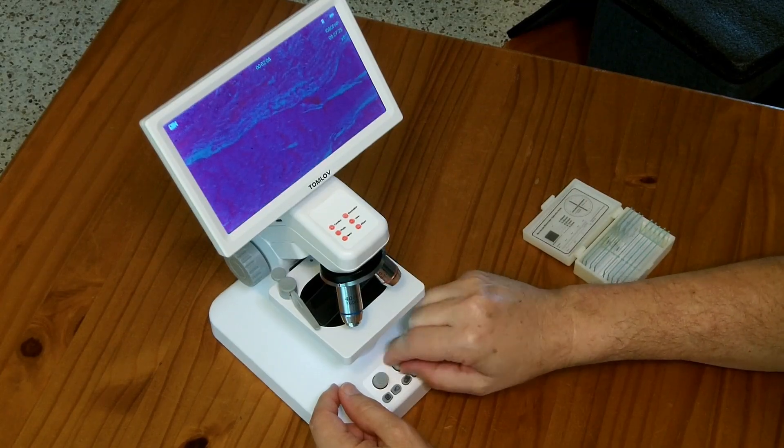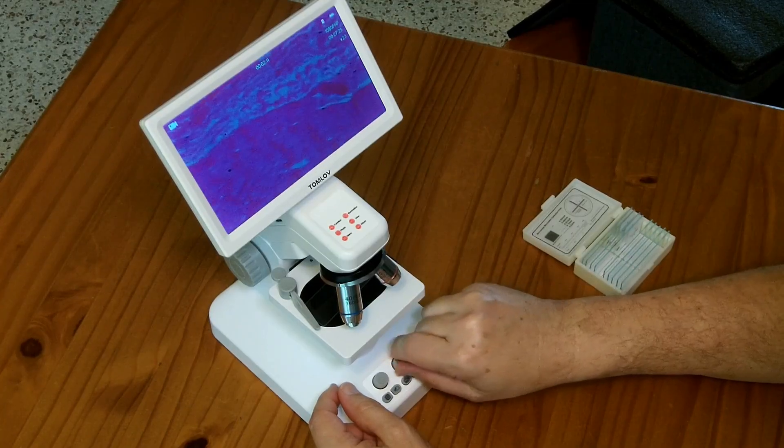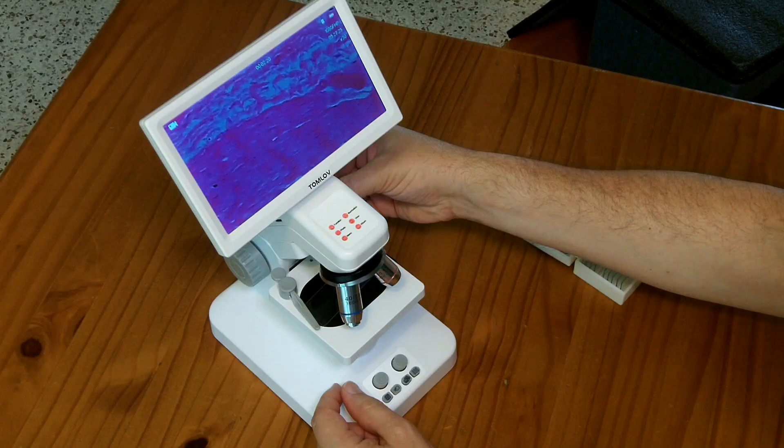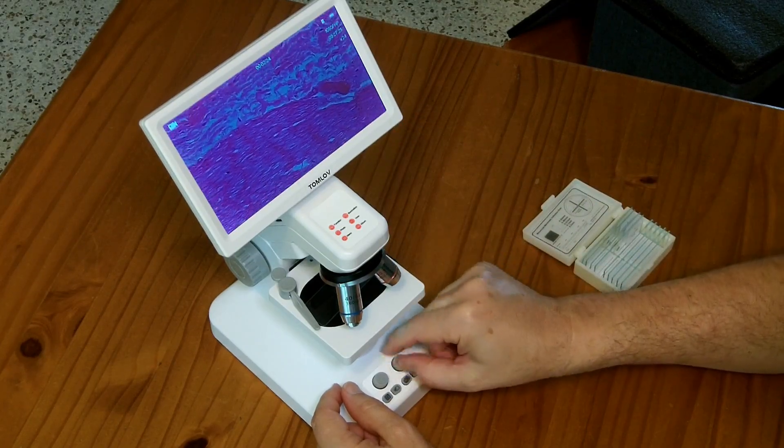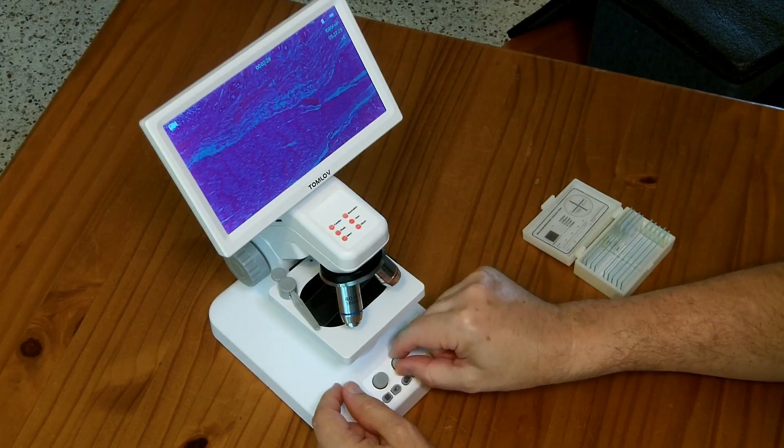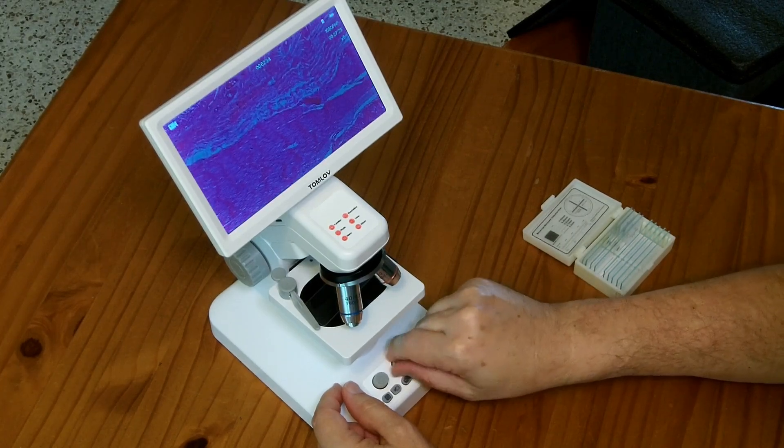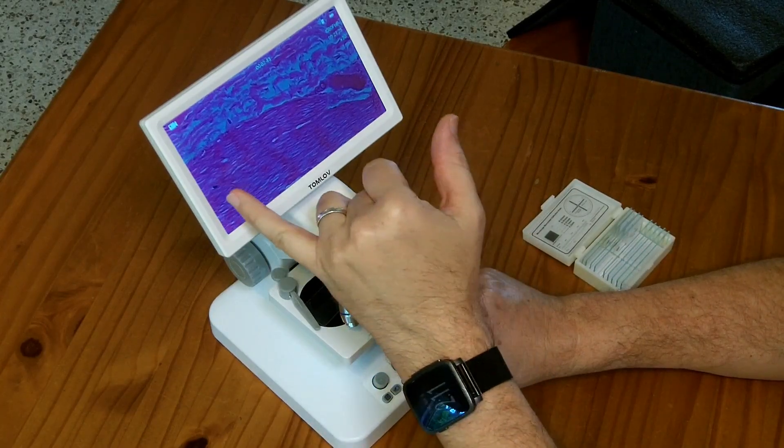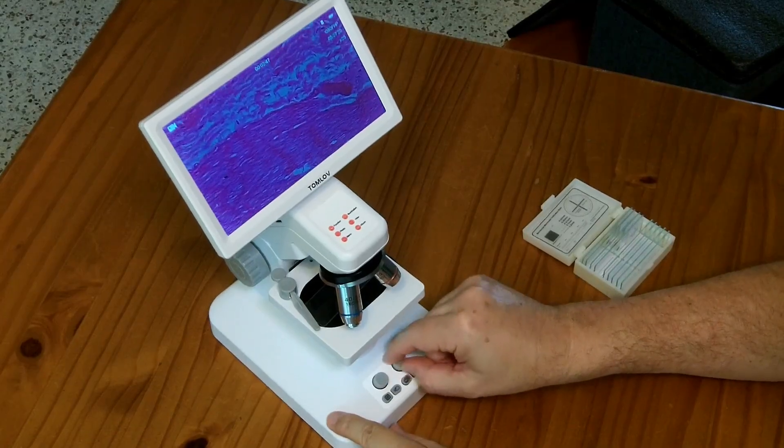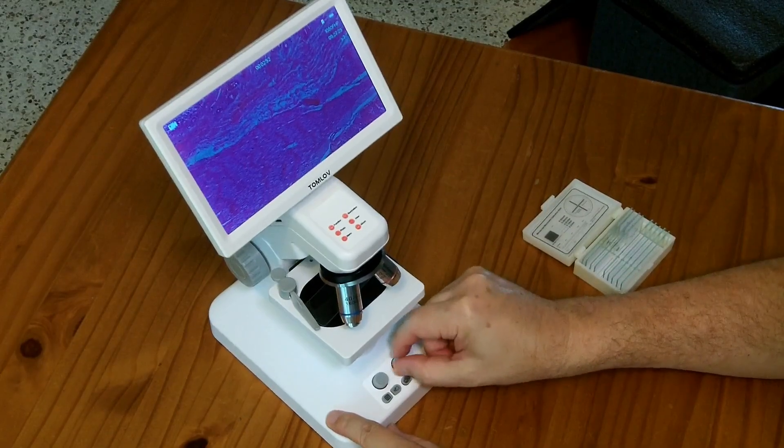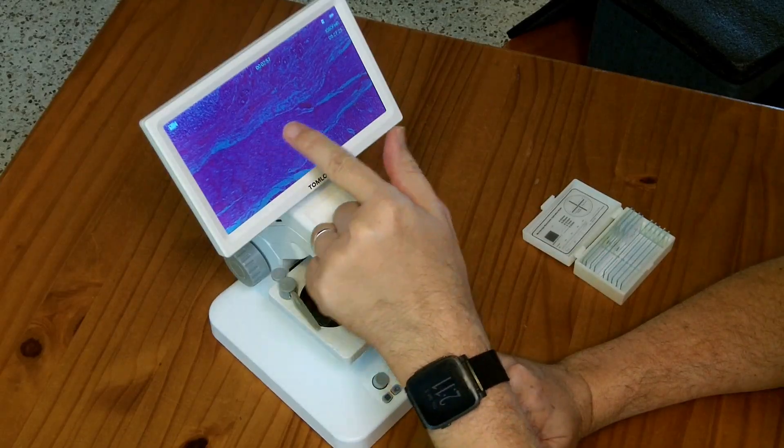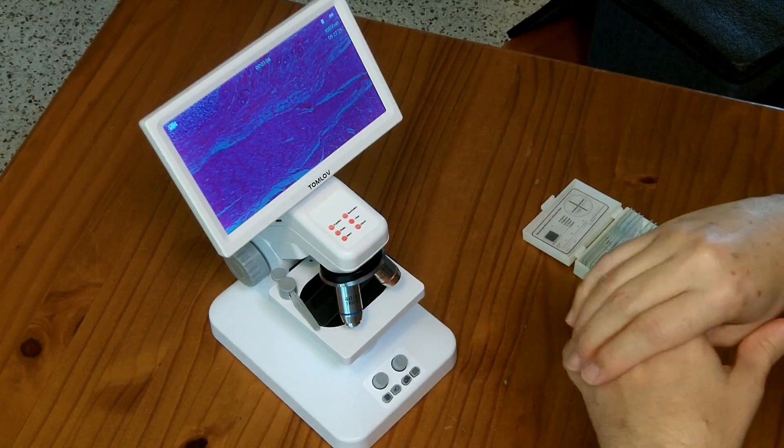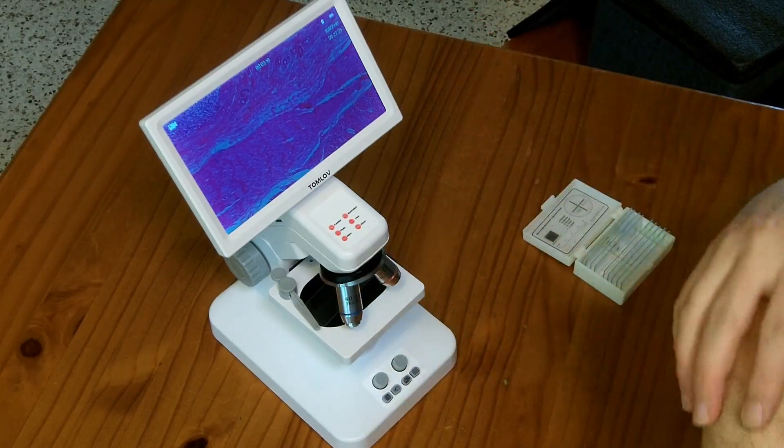Now, there is a digital zoom. So you can do this thing here that says, let's see how high does it go. Okay, it looks like a 30x digital zoom. Obviously, when you're doing a 30x digital zoom, you get some artifacts. And it doesn't really look like it's doing 30 times bigger. So I'm not sure if that's actually a 30x zoom, but you can definitely move into an area. Let's go up to 30. Okay, so at 30x zoom, we have this black spot here to that thing there. And when we back all the way out, we have from that black spot to that thing there. So I'm going to say it's actually a 3x zoom because we kind of have 1, 2, 3. So it basically takes the field of view 3 times larger if you go to x1, 3 times smaller if you go to x3, 0.